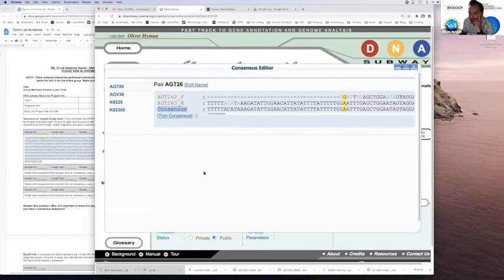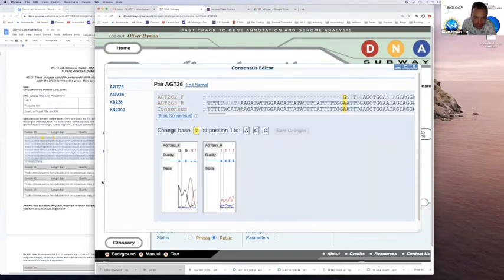Essentially what the software is doing is saying, I've got a forward read in this direction, and I've got a reverse read in this direction. Let's combine those two together and see where they align. And then let's make a single barcode out of that based on the forward sequence. So we're going to flip the reverse sequences over to their complementary base pair to make a single sequence called the consensus sequence. I'm just going to show you. Remember, the consensus sequence is this bottom one. The forward sequence is the top one. So that's our forward read.